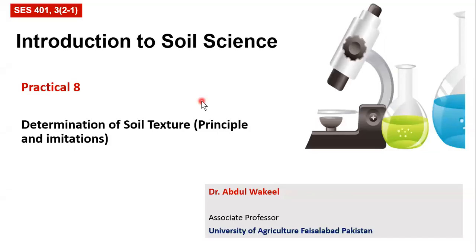Bismillah ar-Rahman Rahim. Today we'll discuss the determination of soil texture. We generally use the Stokes law method, but that has some limitations as well, and there are also a few assumptions. So we will talk about what Stokes law is and what the assumptions of that are.